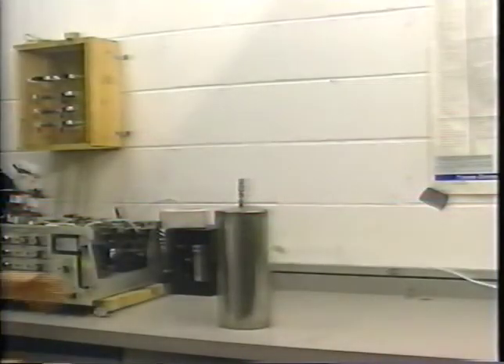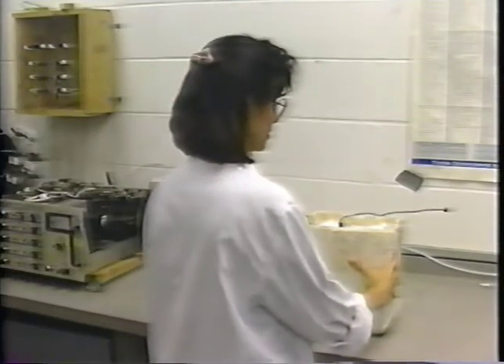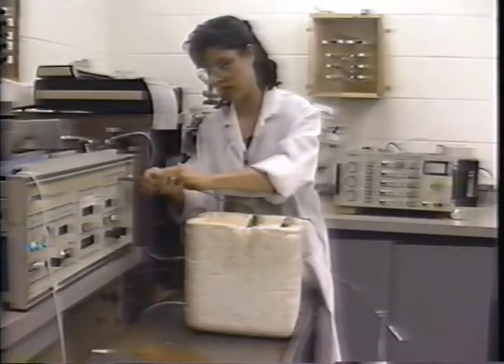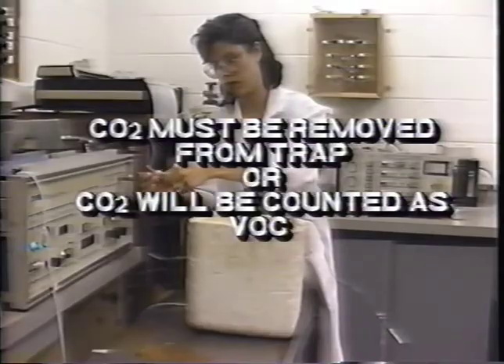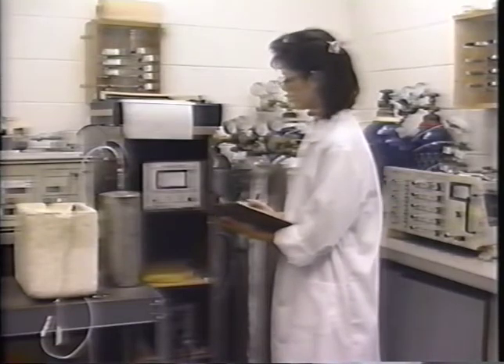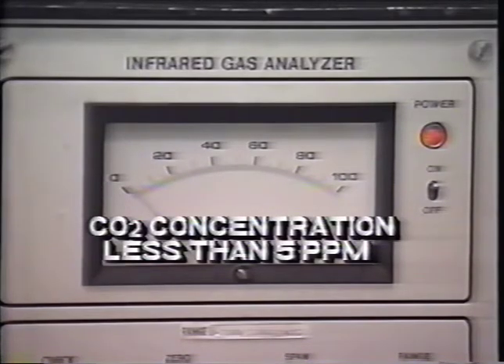To recover the sample, the condensate trap and sample tank are shipped to the lab after sample collection is completed. The trap will contain frozen water, condensed organic material, and a small volume of sampled gas. This gas may contain a significant amount of CO2, which must be removed from the condensate trap before the sample is recovered, or the CO2 will be counted as VOC. The condensate trap is purged with zero air, and the purged gas is collected in the original sample tank. The zero air purge continues until the carbon dioxide concentration of the trap effluent is less than 5 ppm.